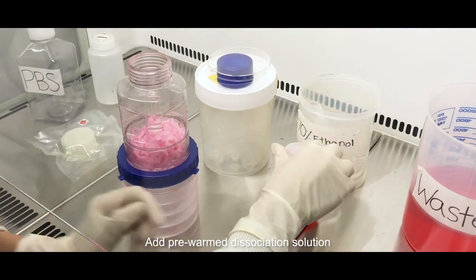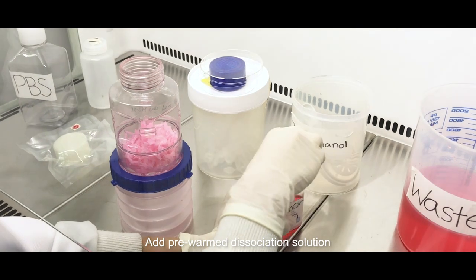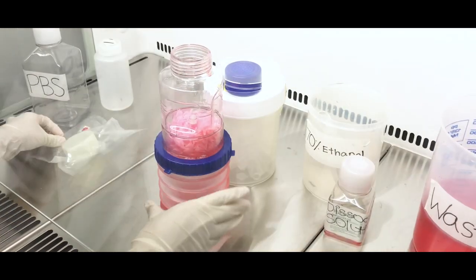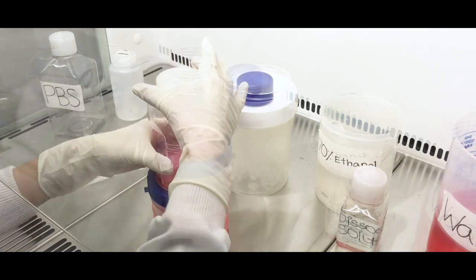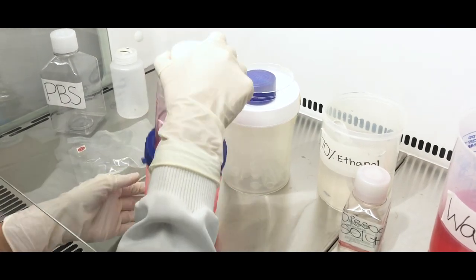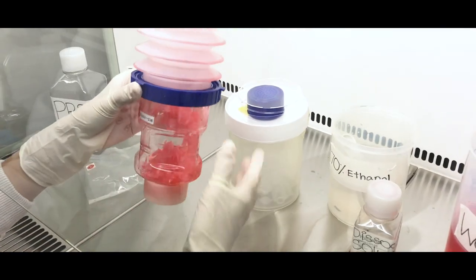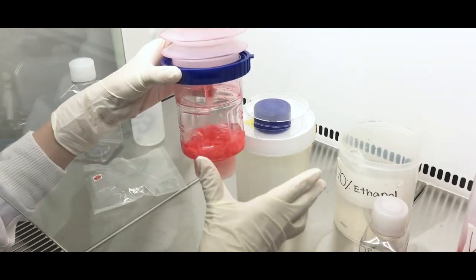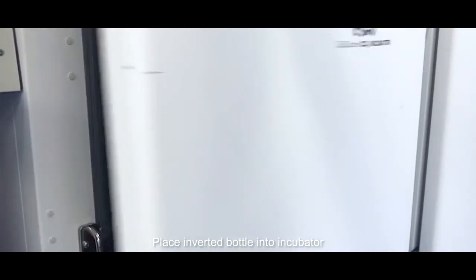Add 120 milliliters of pre-warmed dissociation solution and cap the bottle with a white non-vented cap. Then invert the bottle and swirl it to ensure all carriers are submerged in the solution. Place the inverted bottle back into the incubator.